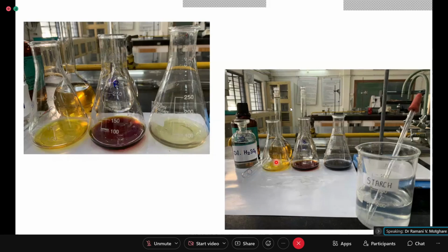Then you are supposed to add the 1/4 test tube of KI solution to it and a pinch of sodium bicarbonate and keep it in dark. So when you keep it in dark for 5 minutes, then you take it out, you will find that the solution appears such dark brown color. Such dark brown colored solution, you have to first titrate with hypo solution till you get a pale colored solution. Look, from dark brown it became pale.